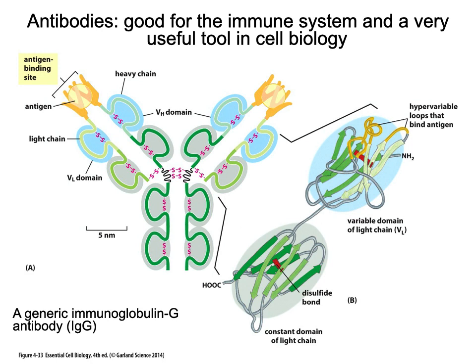So if that antigen, if that protein is present in our cell lysate, our homogenate, or extract, it would get trapped and bound until we break that bond. Okay.